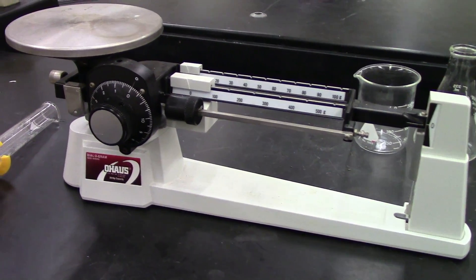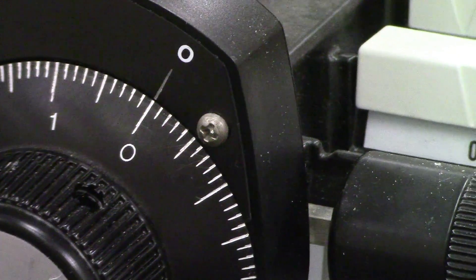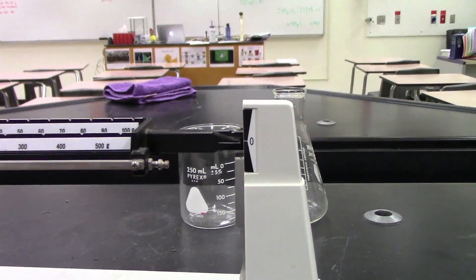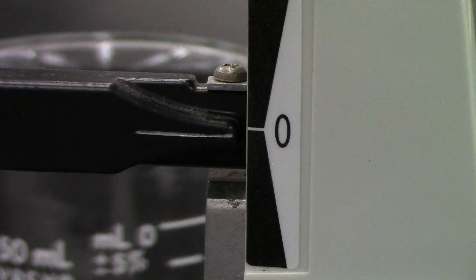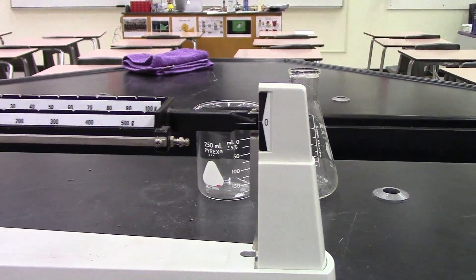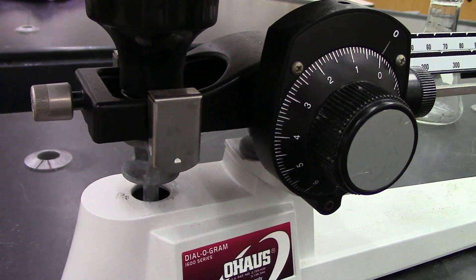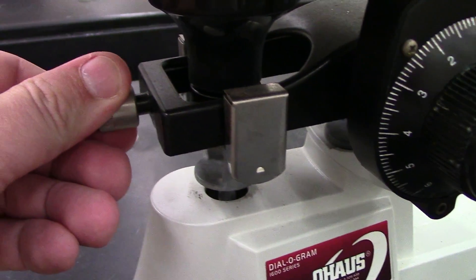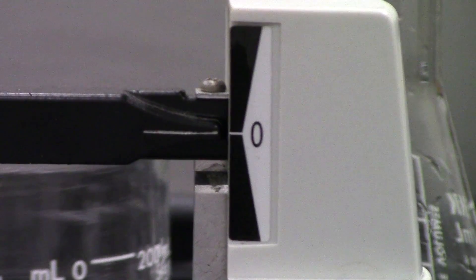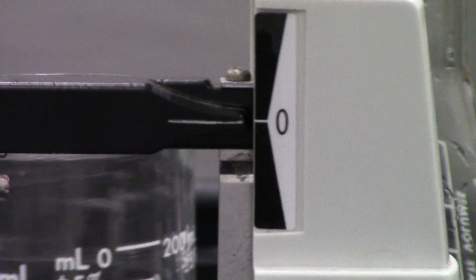The first thing I'm going to do is make sure that my balance is set to zero, and we actually get a reading of zero. It turns out we don't, so we need to do an adjustment. On this particular triple beam balance, the adjustment is made by turning this knob, and that will adjust the zero point. I've made the adjustments and you can see now when zero grams are on the balance, the indicator reads exactly at zero.